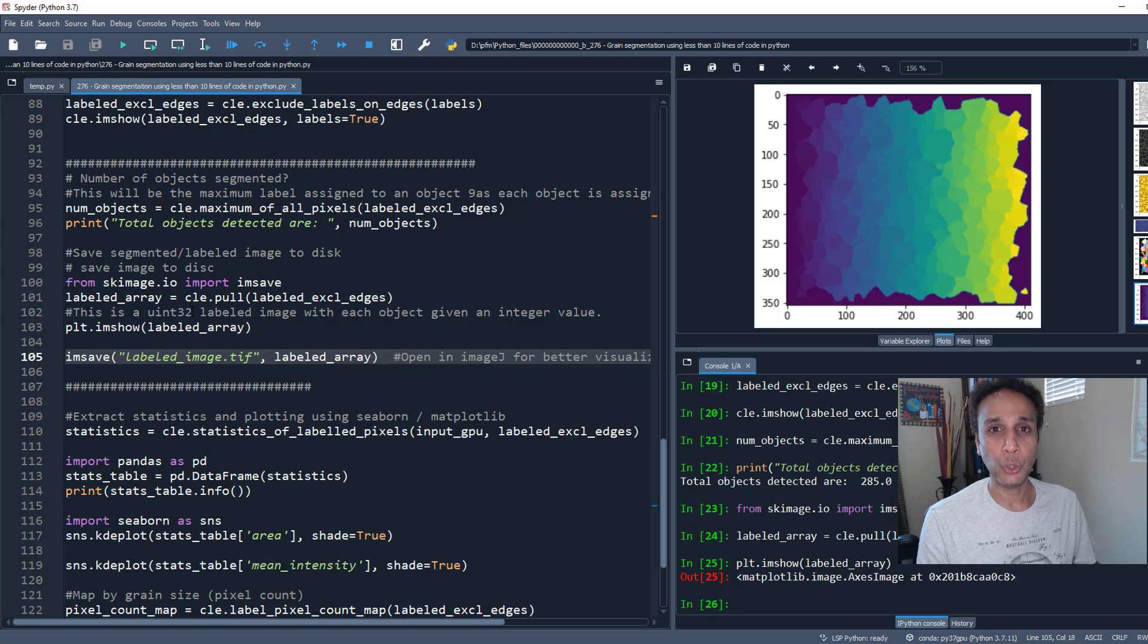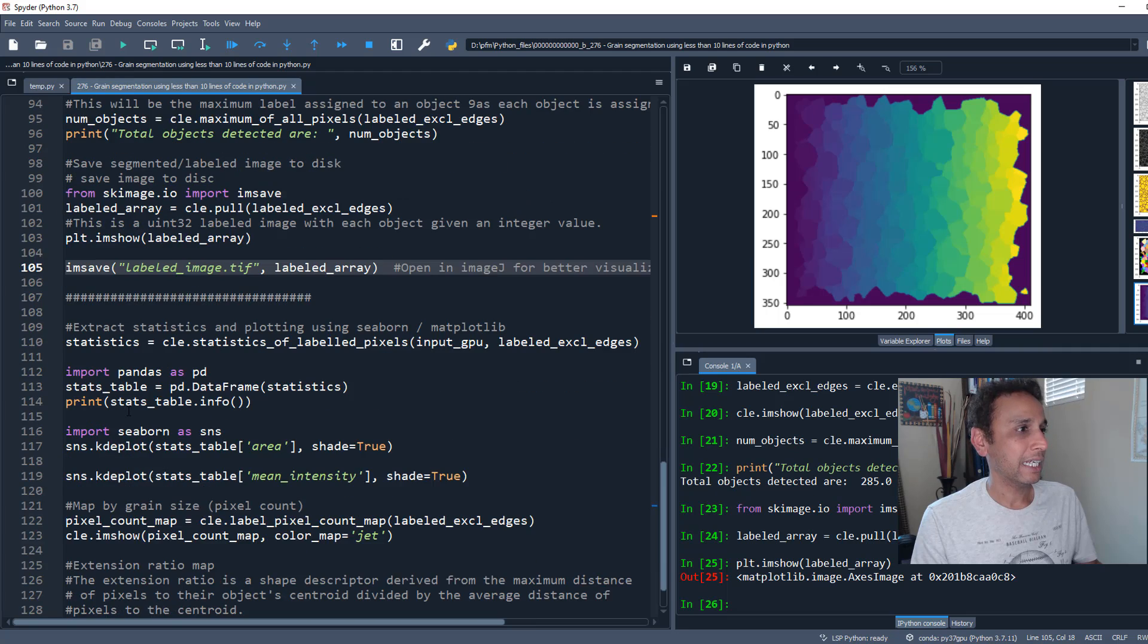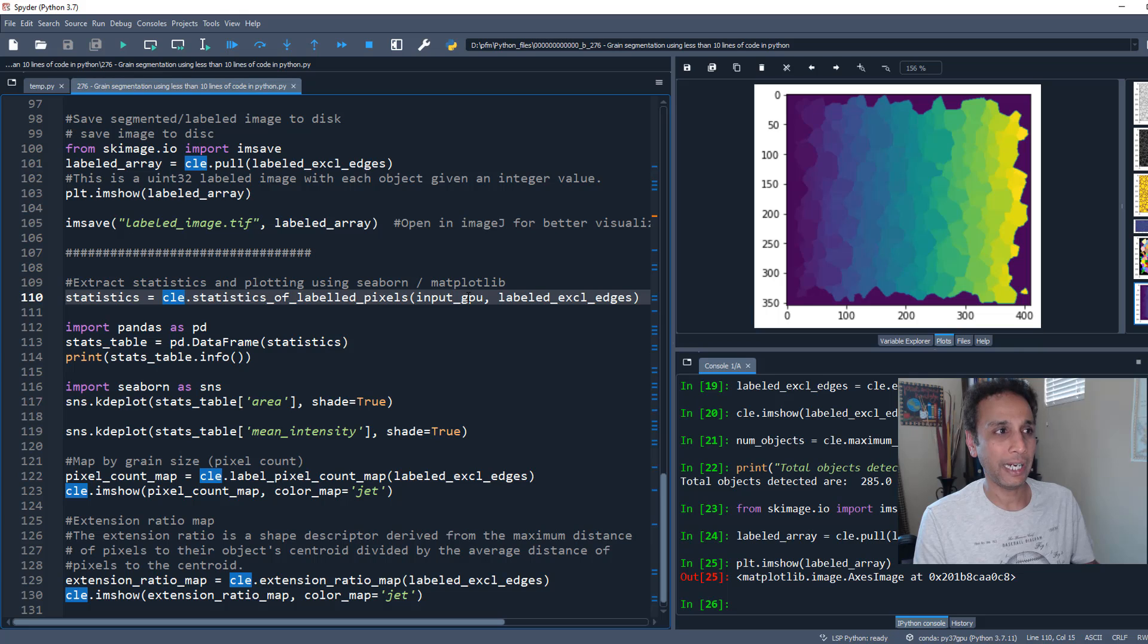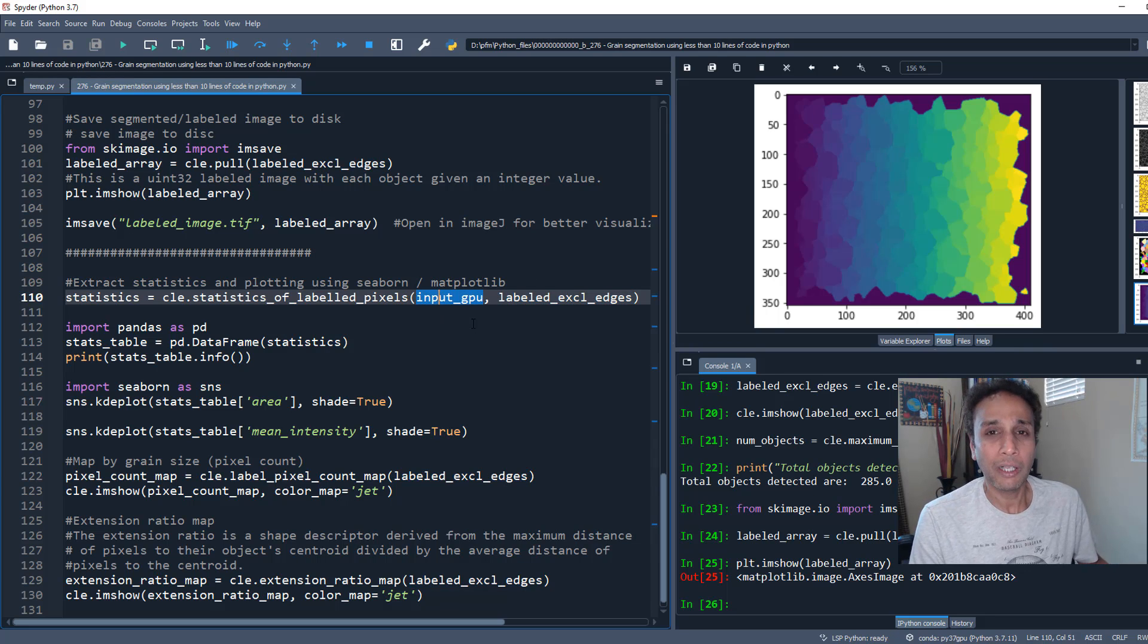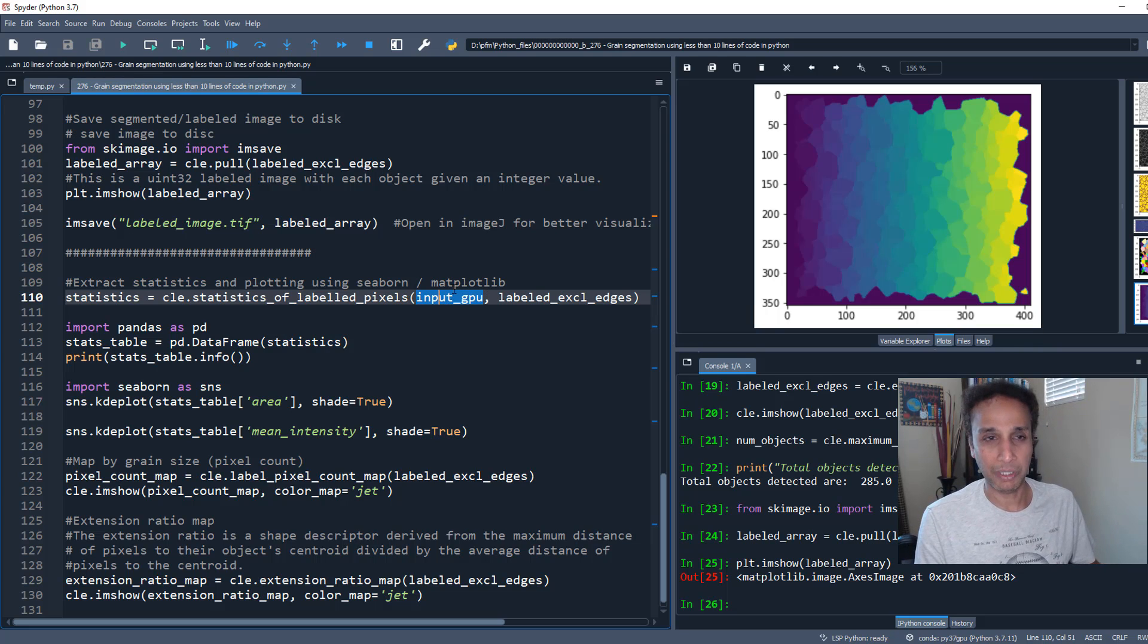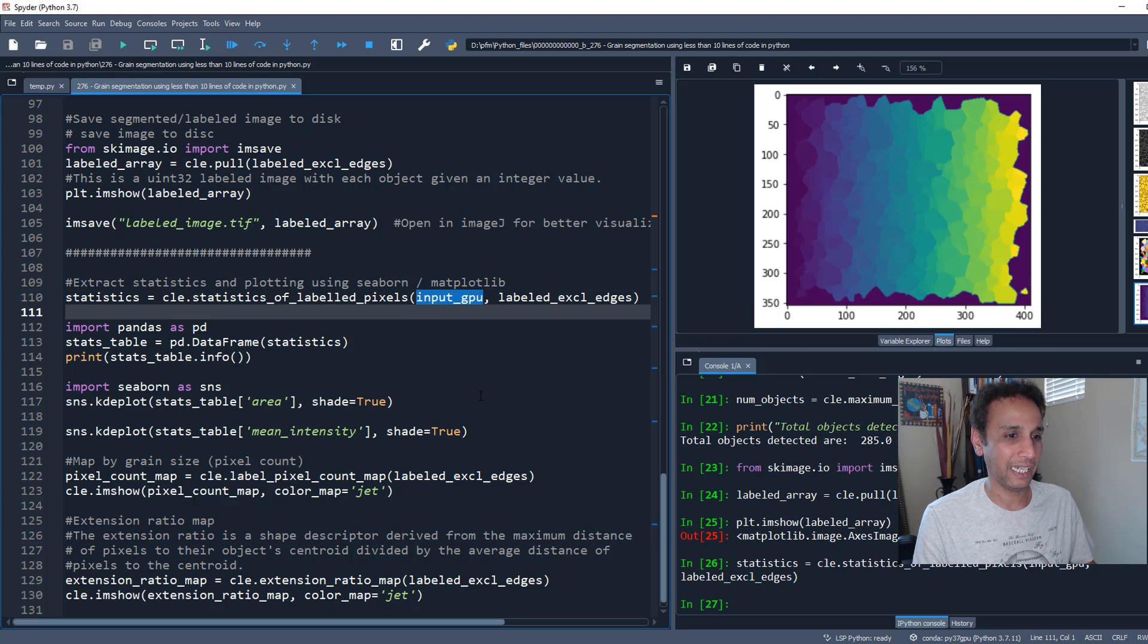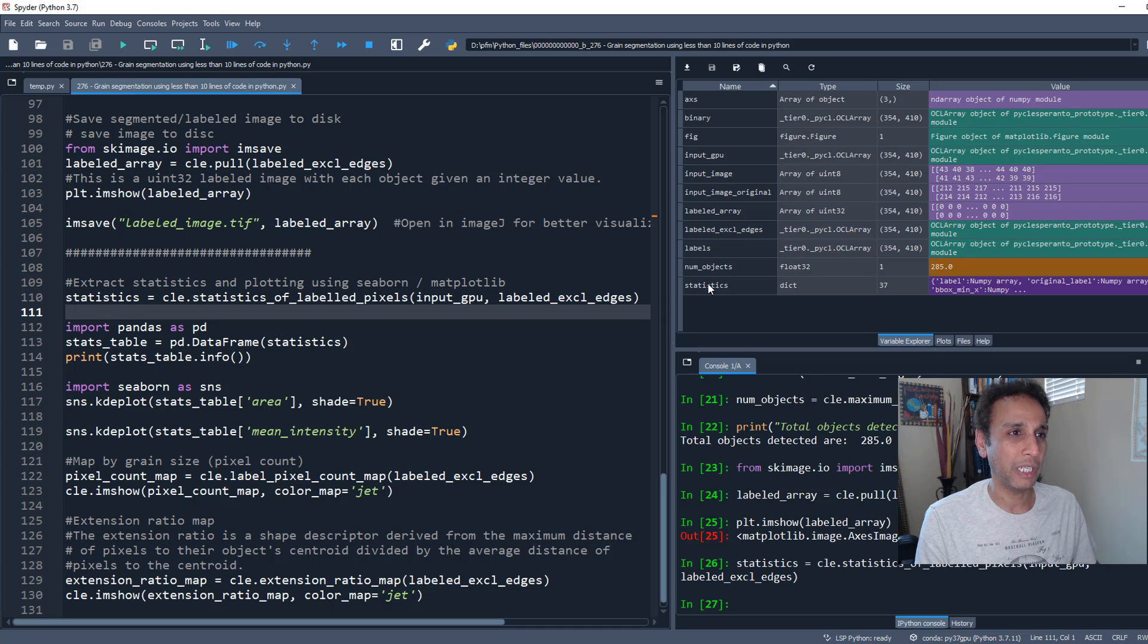When it comes to statistics, ClassPeranto has statistics of labeled pixels. Give your input image and the labeled image, and it'll pull all the statistics. Why do you need the input image? If you want intensity values within each grain, you need the input image. Let's get our statistics.